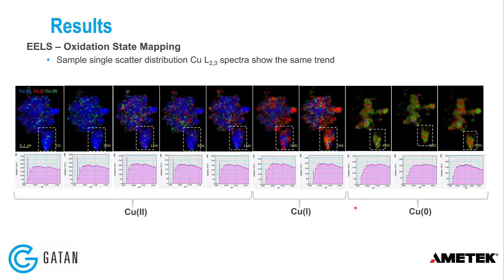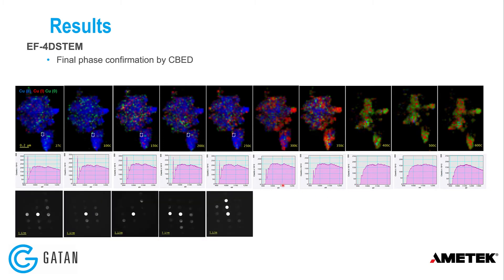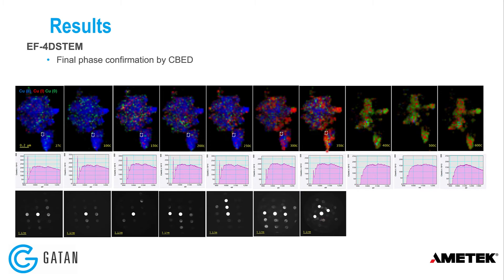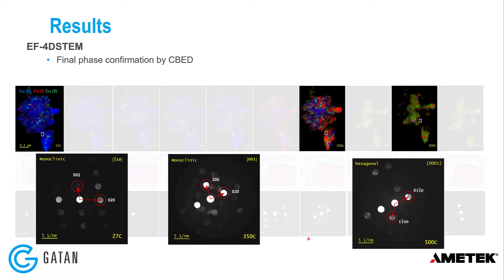As a final validation, phase confirmation is done by CBED. Convergent diffraction patterns extracted from sub-regions of the 4D STEM data fall into three main groupings. The first five patterns look similar; the next two at 300 and 350 Celsius look slightly different; and the final three at highest temperatures look different again. The room temperature pattern is characteristic of monoclinic copper(II) oxide in a 110 zone axis orientation. At 350 Celsius it remains monoclinic but in a 001 zone axis orientation due to crystal rotation. At higher temperatures, pure metal regions show copper metal in a hexagonal phase.